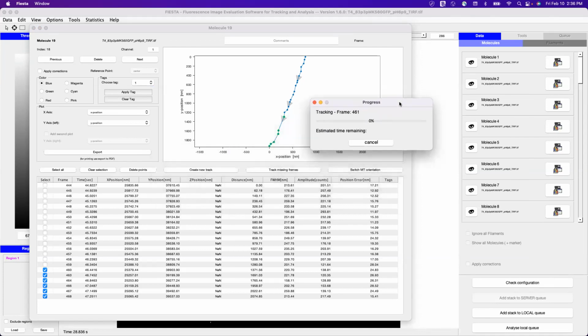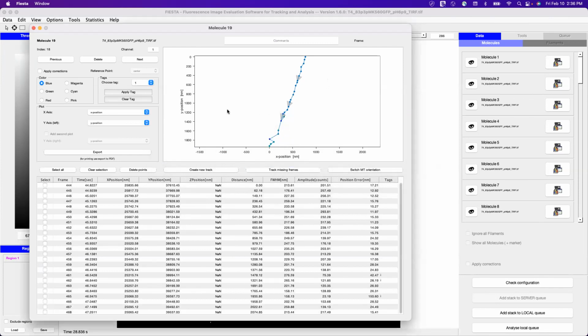Can you recover the data you deleted? Yeah, you can basically just open up the same file that you originally opened up, because when you delete it, it's not going to overwrite. I suggest that once you delete or modify anything, you save as a different file.